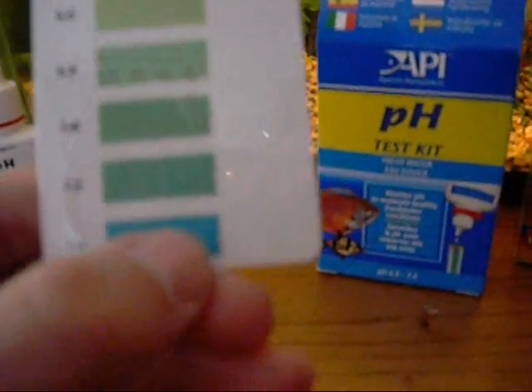So here's the pH — it goes 6.0, 6.4, 6.6, all the way up to 7.6. Ammonia goes up to 8.0, which is way too much.